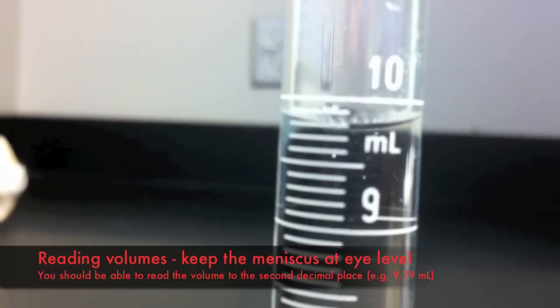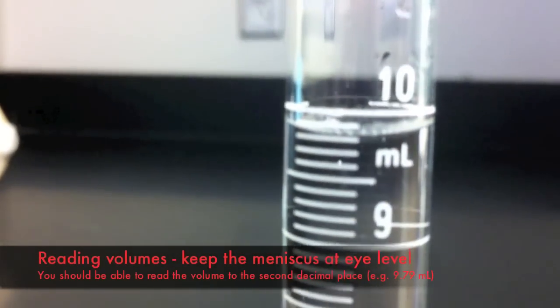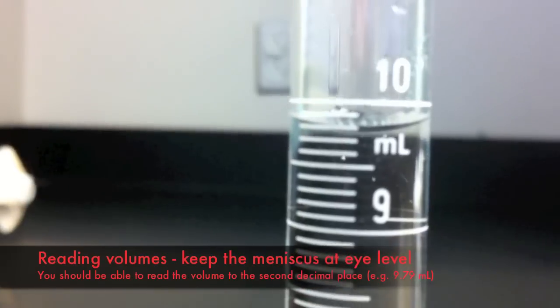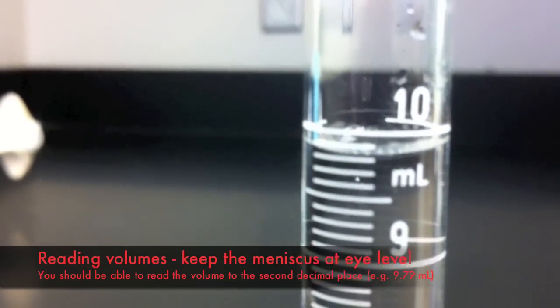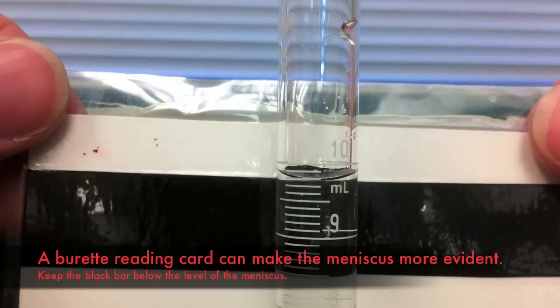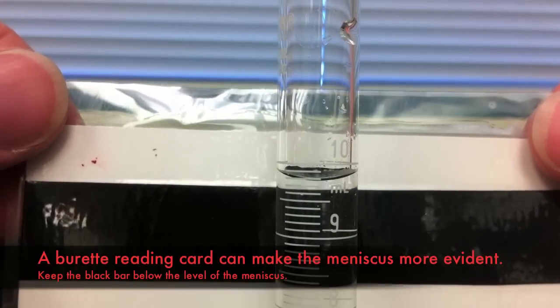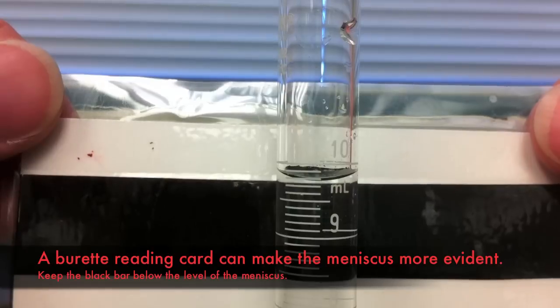To record the volume in the graduated cylinder you want to carefully measure the meniscus on the gradations. Be careful to look level at the level of the meniscus, not from above or below. You may wish to use a burette reading card to help you identify exactly where the meniscus is positioned.